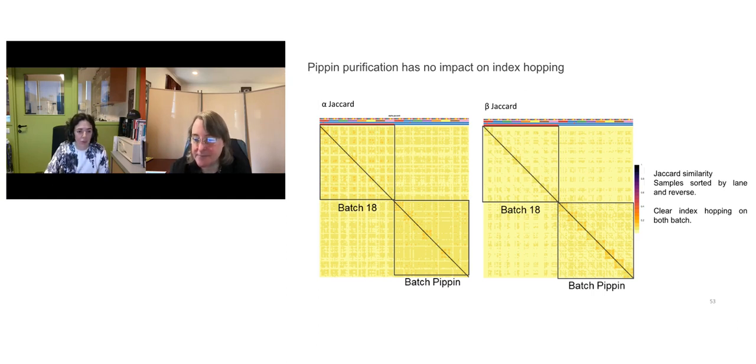And you can see those really nice squares that are quite unusual when you do repertoire, especially if it's human samples, but also in mice. In fact, those squares represent the similarity, which is not negligible, between samples that shared more than the biology.